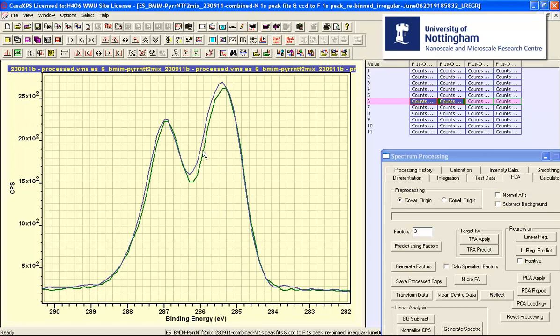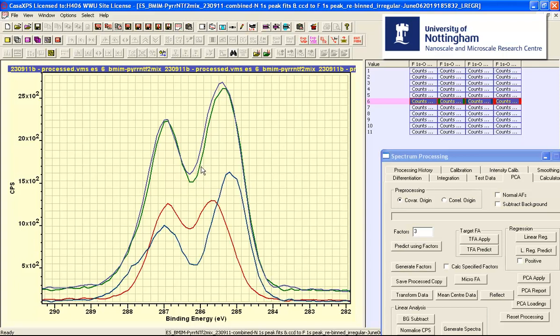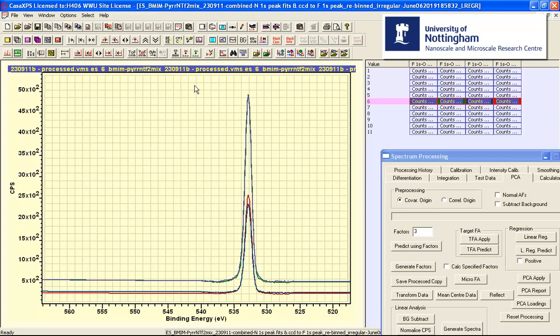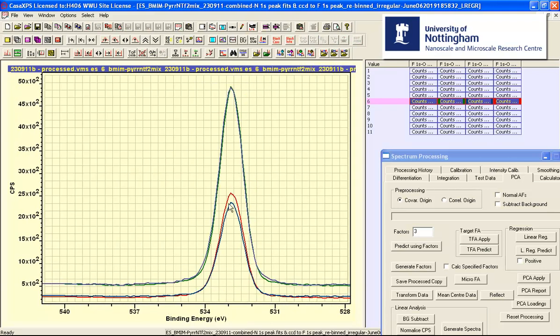is a linear least squares calculation that is an approximation to the other, and the approximation is obtained by these basis functions being scaled using linear least squares calculations, so that when we overlay these, you can see that the green spectrum is formed by the combination of adding these two together, and these are the two different forms for the ionic liquid, the pure forms that were used as the basis vectors, and the entire spectrum has been fitted in this sense.